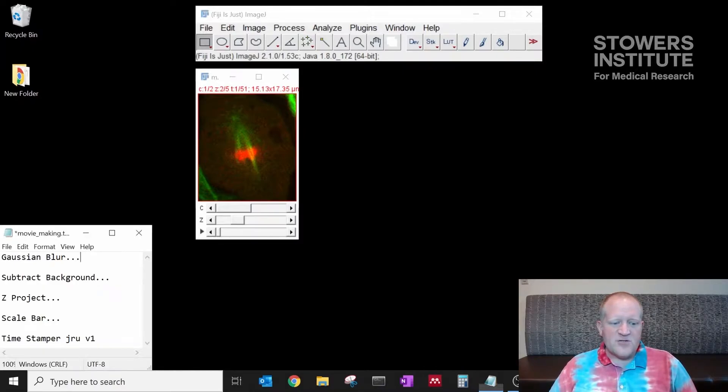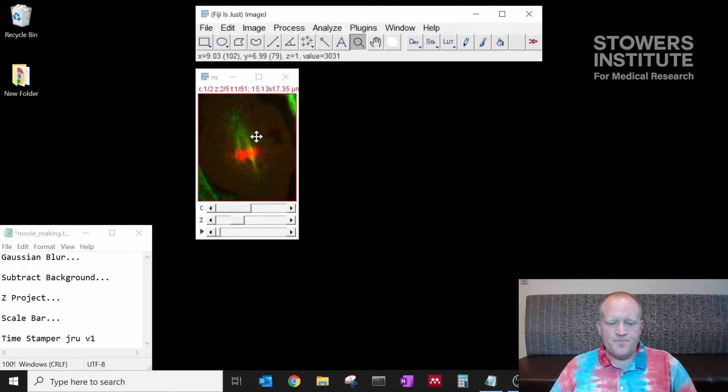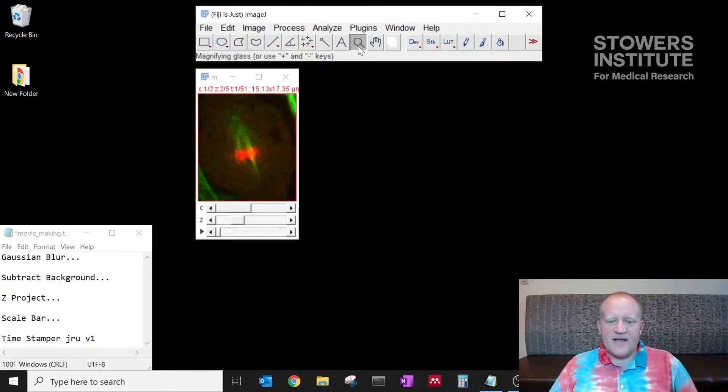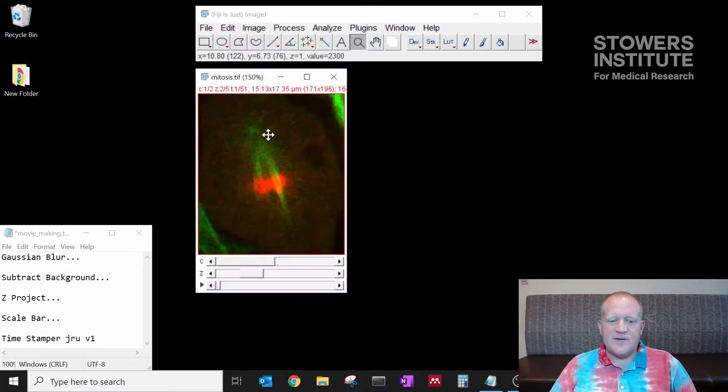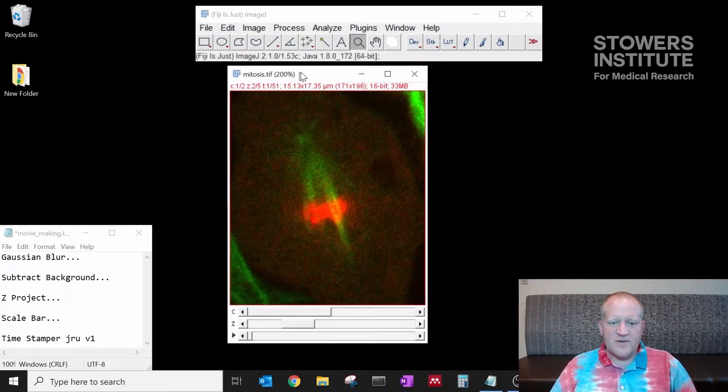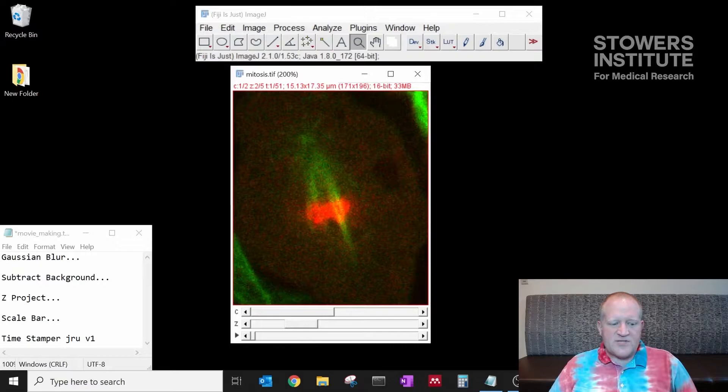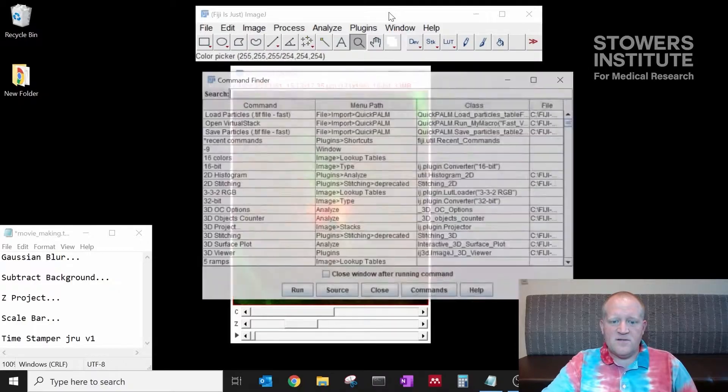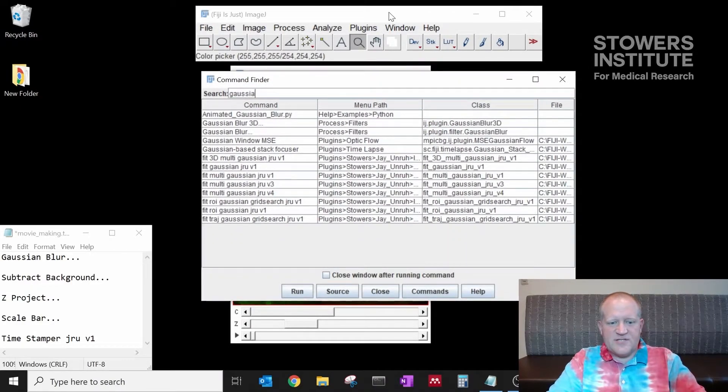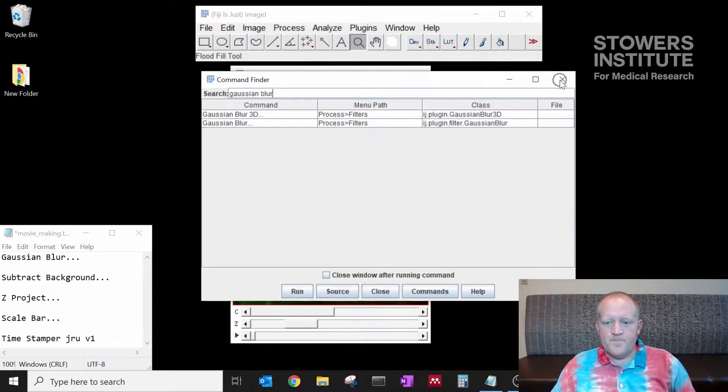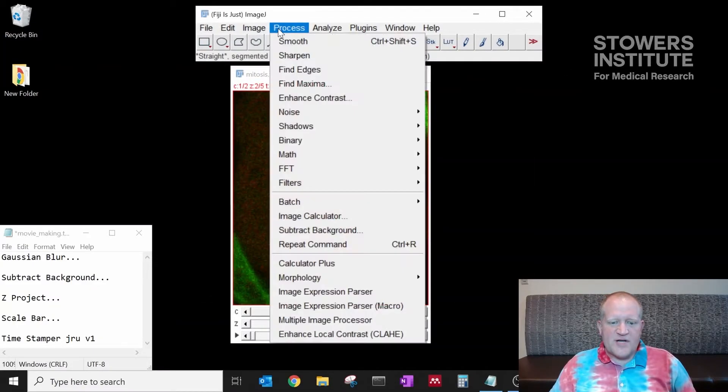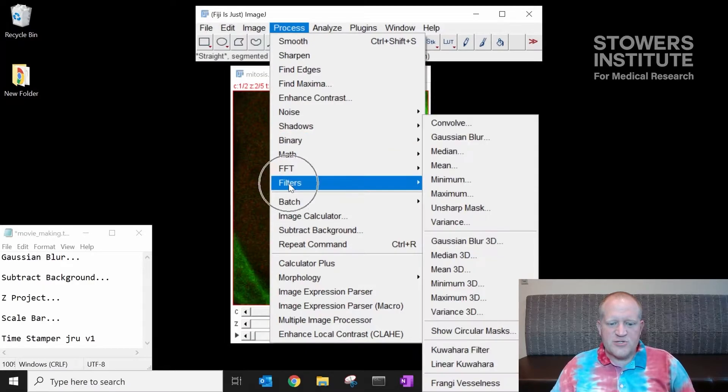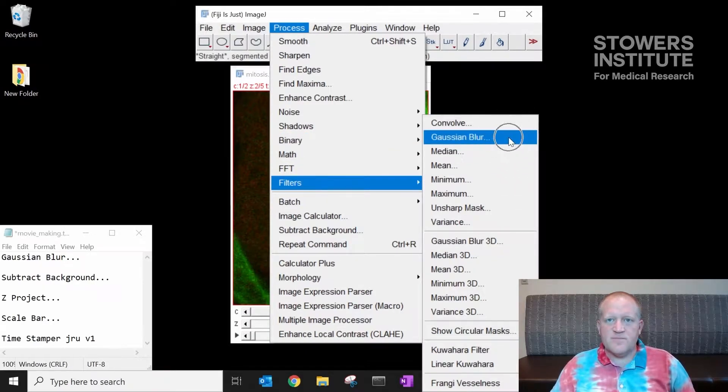The first thing we're going to do is apply a slight blur to the data of only about one pixel. I can zoom in on the data by selecting the magnification button, the magnifying glass, and then left clicking in the image. Now I'm going to run a Gaussian blur. You can do that by clicking on the Fiji bar and typing L and typing in Gaussian blur or it's in process, filters, Gaussian blur.